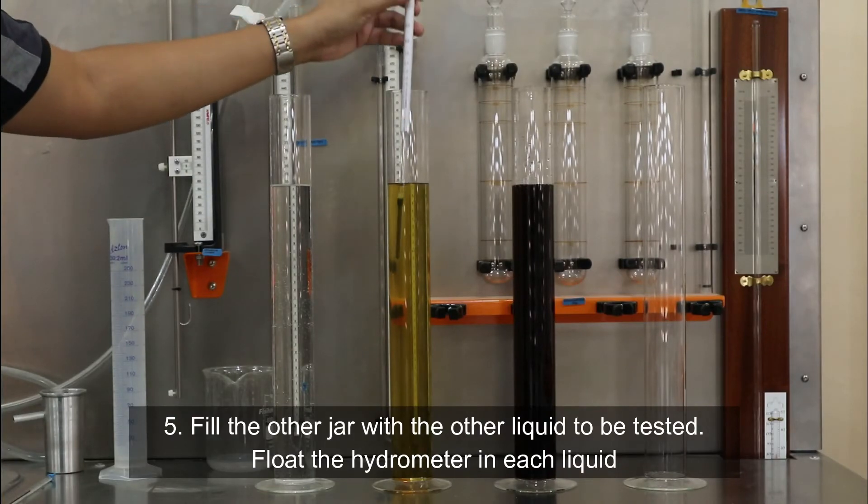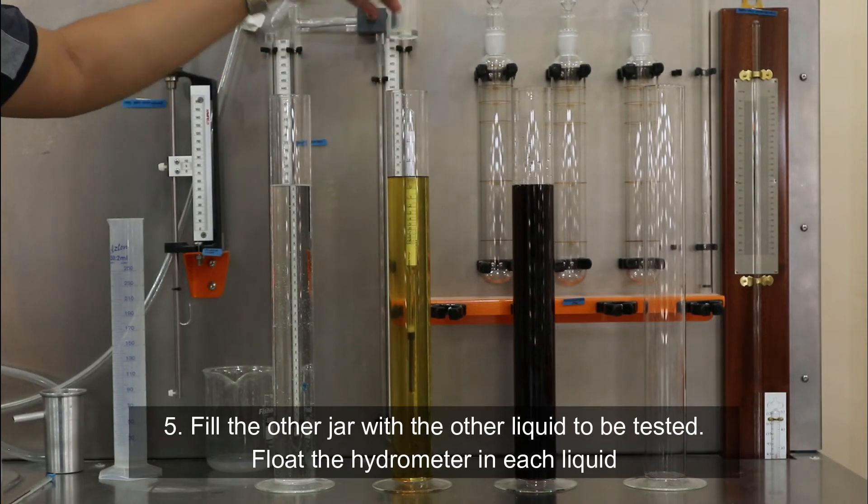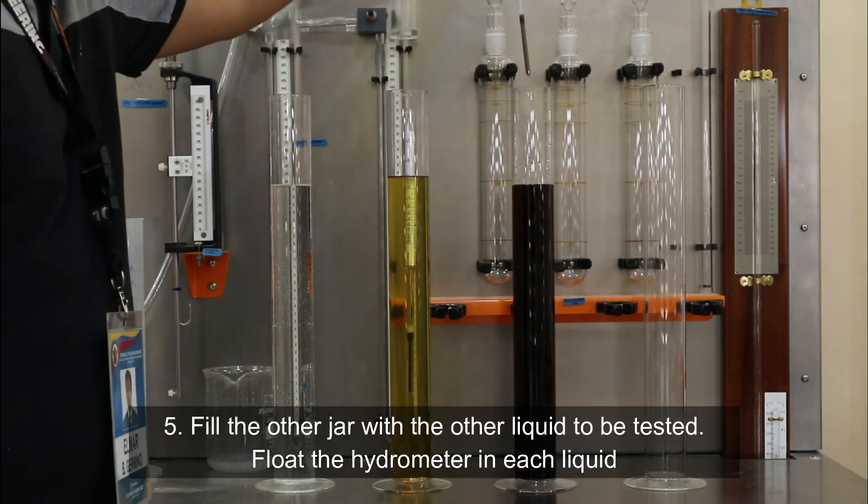Fifth, fill the other jar with the other liquid to be tested. Then, float the hydrometer in each liquid.